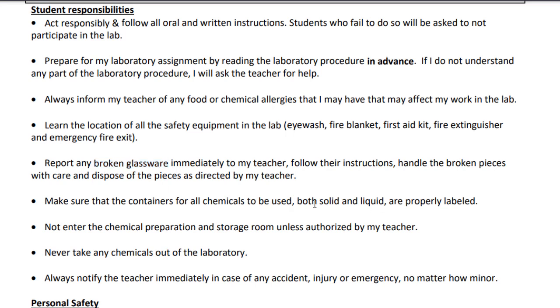Make sure that anything you take, whether it's a solid or a liquid, is labeled properly. A lot of things are going to end up looking like water. You're going to see that in your high school career: you have 4 different liquids in front of you, and none of them are water, but they all look identical to water. So you want to make sure that you're always labeling what you take, so the hydrochloric acid doesn't suddenly get mixed up with something else that looks exactly the same.